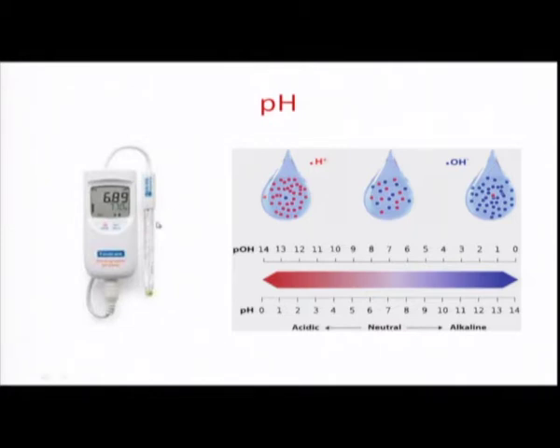But laboratory methods are always more reliable, which works on a pH meter, that is a glass electrode and calomel electrode, combined. It should be calibrated frequently with a standard buffer like 4 or 7, 7 or 9.2, calibrated daily before use. Apart from the pH meter, sometimes colorimetric methods are also used with dye indicators or paper. Color indicator papers are also available for measuring pH. That is all crude, but the reliable method is the pH meter.